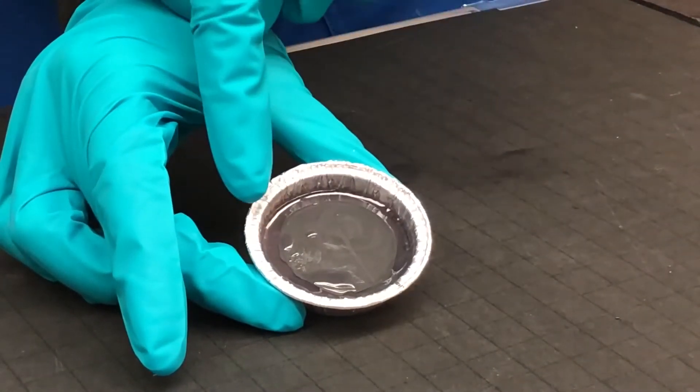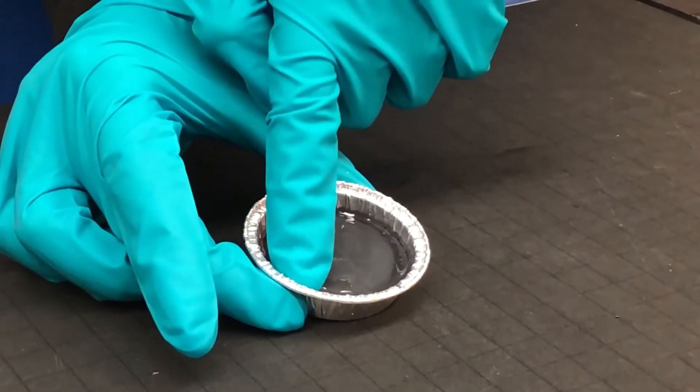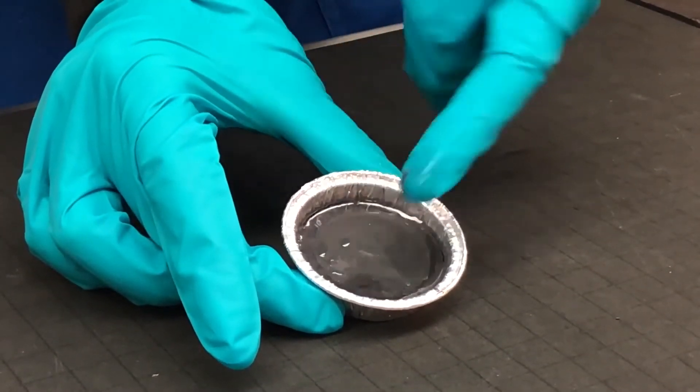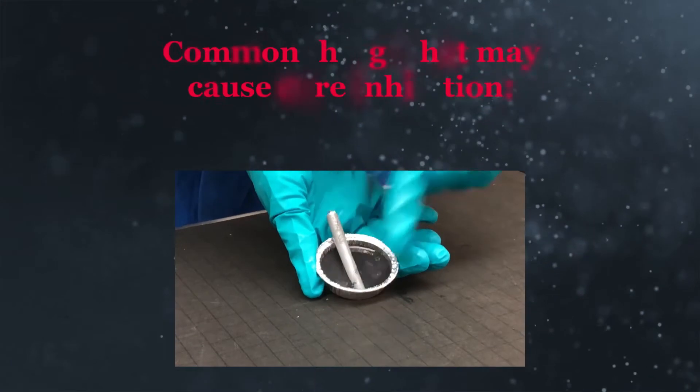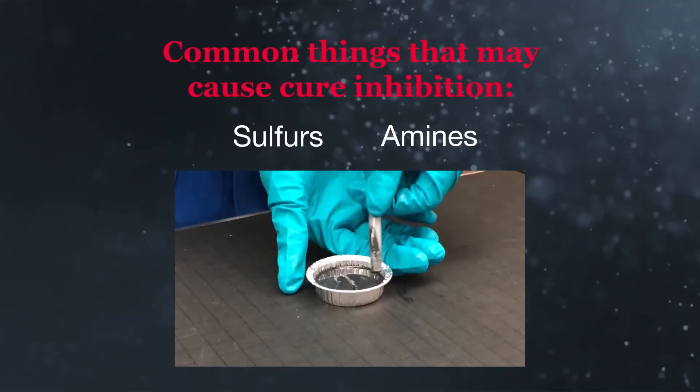To determine where the problem came from, it is often useful to try to determine exactly where the issue is observed on the part and within the silicone and if cure inhibition is the cause. The inhibitors are often materials containing sulfur or amine species, though there are a few others.